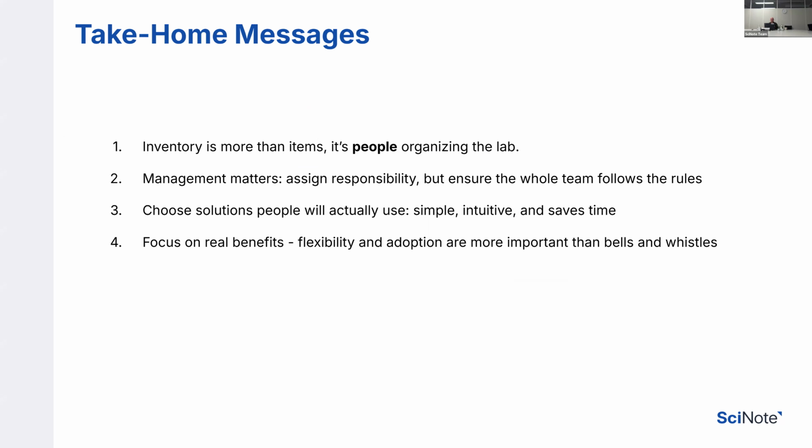A few things that I want everyone to be aware of before I jump to other stuff. The take-home messages for this introductory webinar: inventory isn't just about items on a shelf, it's really about how people are working with it and how they organize their work. It's people actually organizing the lab, not the software.